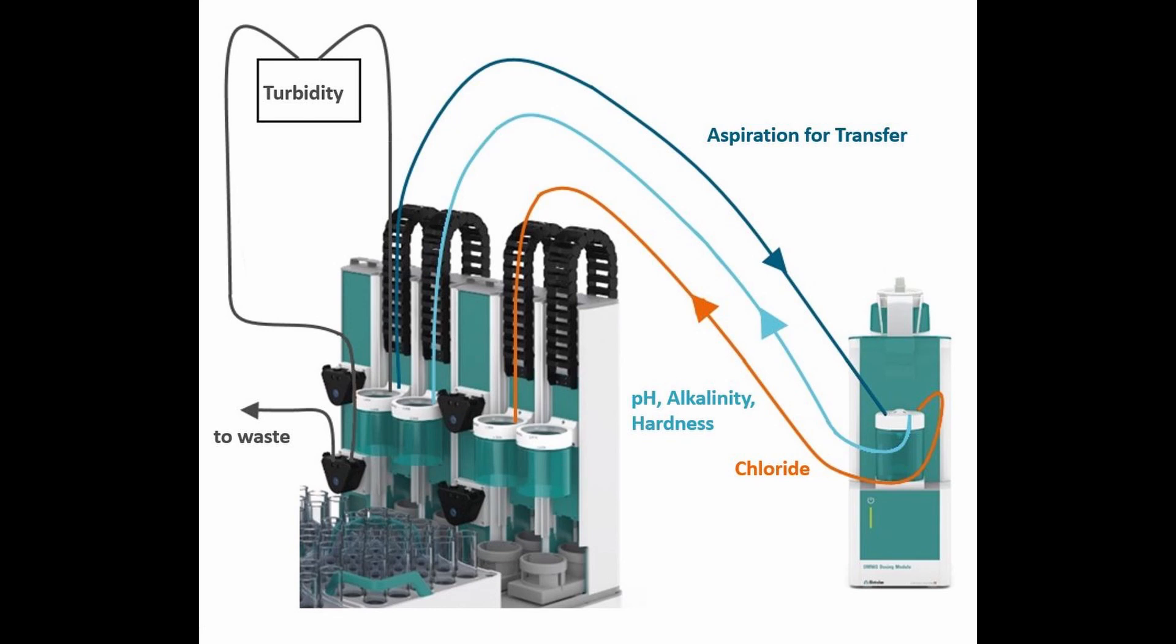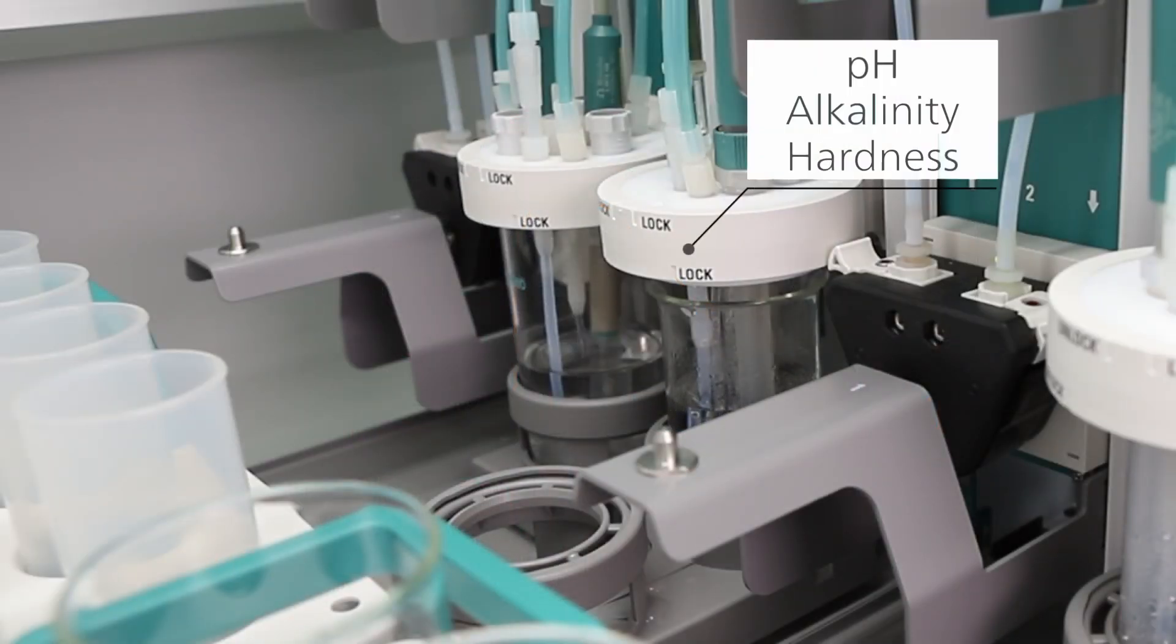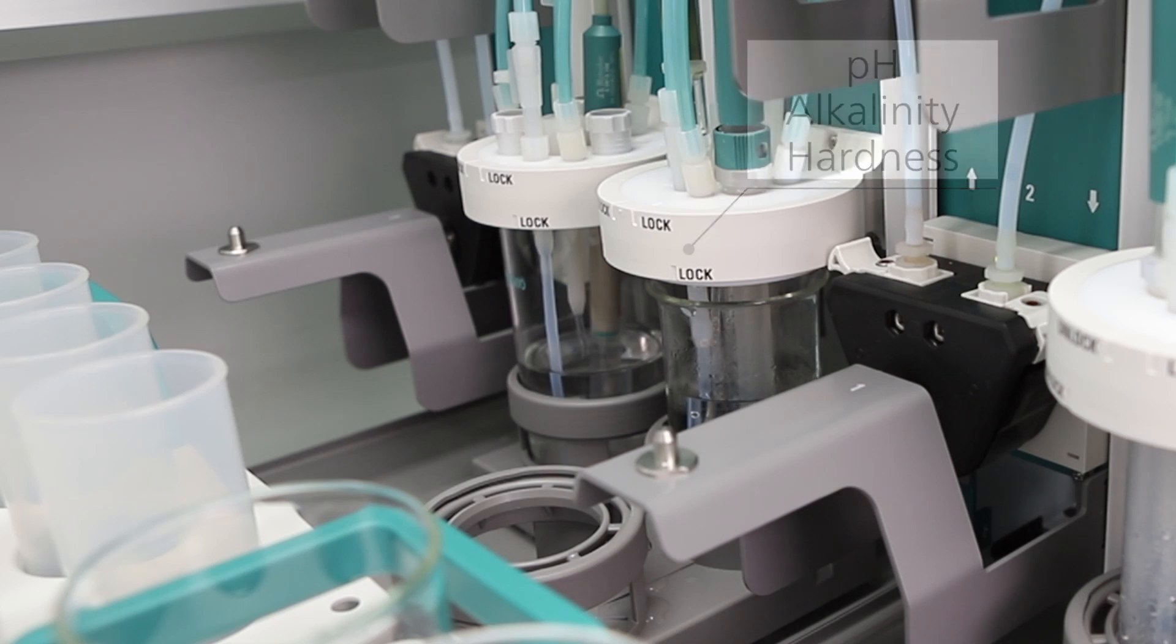For the determination of pH, alkalinity and hardness, 100 ml of the sample solution is transferred to the workstation equipped with a digital aquatrode electrode and a digital calcium ion selective electrode.